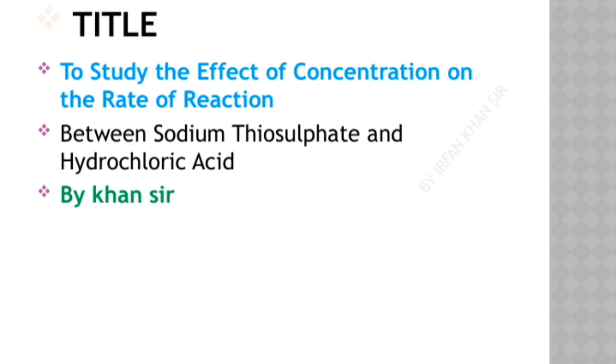I'm excited to share with you our study on the effect of concentration on the rate of reaction. The focus will be on the reaction between sodium thiosulphate and hydrochloric acid. I'll be guiding you through the key concepts, the experiment we conducted, and what we discovered about how concentration impacts reaction speed. Let's get started.